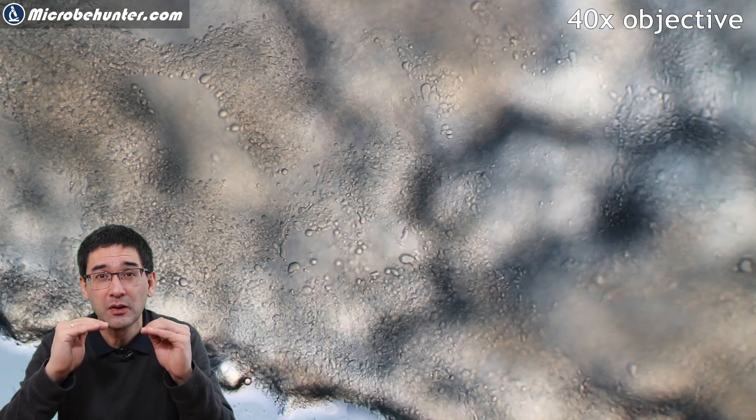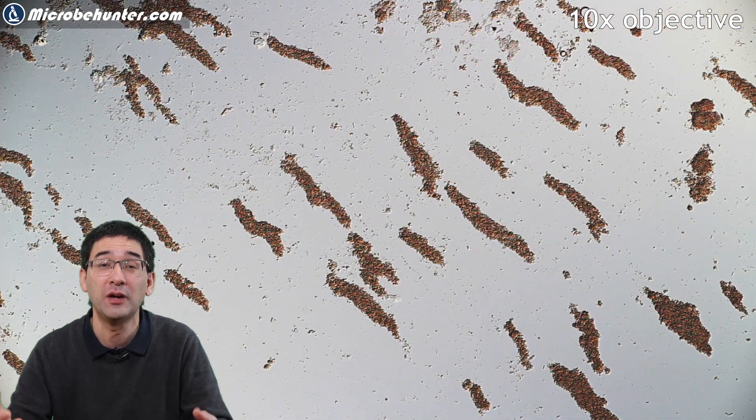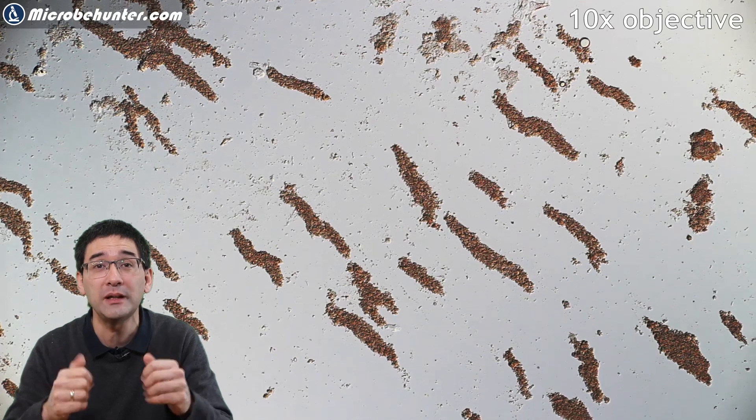I increased the magnification. Of course, it looks a little bit blurry, but I tried to get the surface of the biofilm of the grains, the kefir grains. But again, there was not a lot of detail visible. I was a little bit disappointed, I have to admit. I wanted to see a little bit of the fungus, not so much visible either. I did some focusing around and then took some of the liquid.